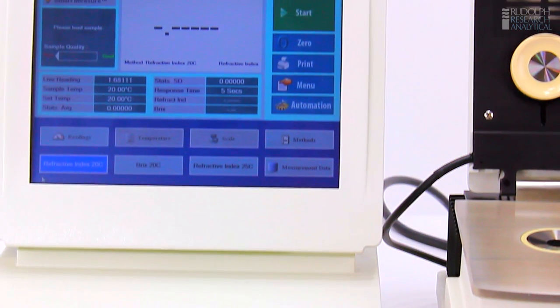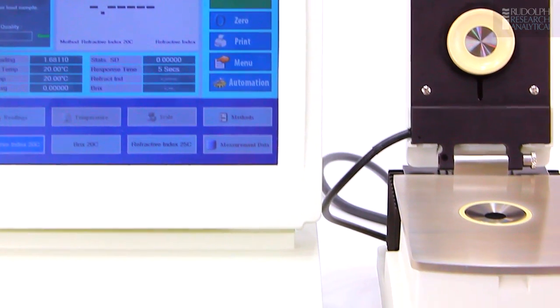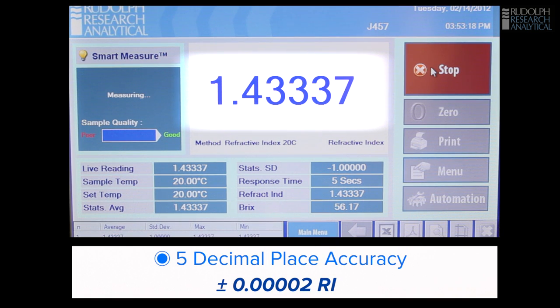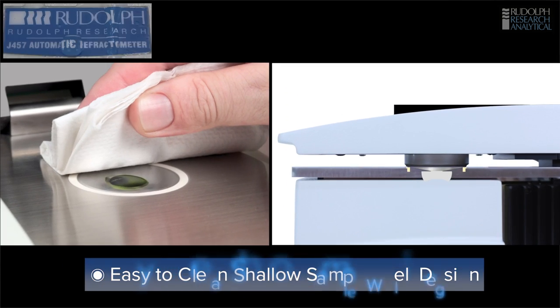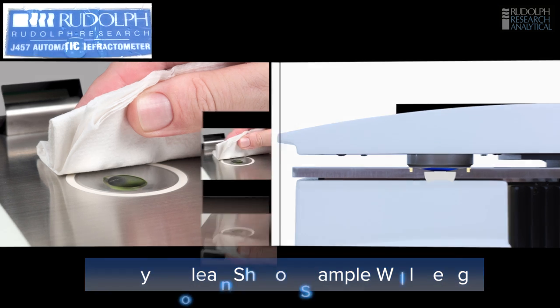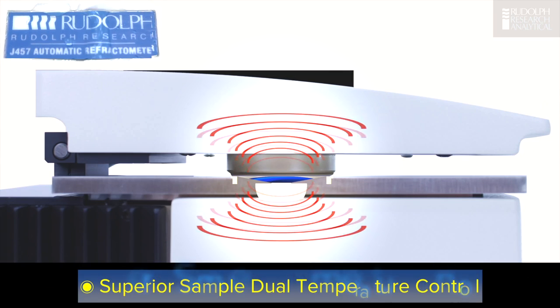The J457 digital benchtop refractometer comes standard with many features required in today's modern laboratory. It has fifth decimal place accuracy. It has an easy-to-clean, shallow sample well design, and of course, built-in temperature control.